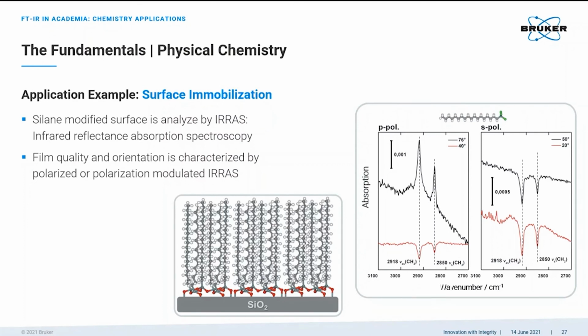I won't go into details here. In this project, the preparation parameters of this monolayer have been optimized by FTIR, since the monolayer has been characterized well in the past using IR, and the IR spectra were well known.